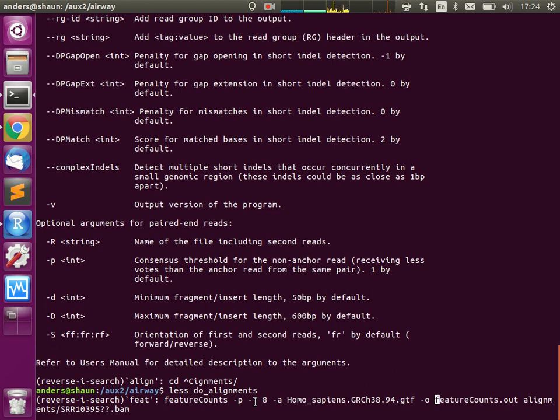And so this is your usual strategy. You first get your FASTQ files, you build an index if you don't already have one, because if you always work with mouse, you have to build the mouse index only once. So get your reads, build index, align the reads. Then you use some featureCounts program to get the count table, and then you can work from there.